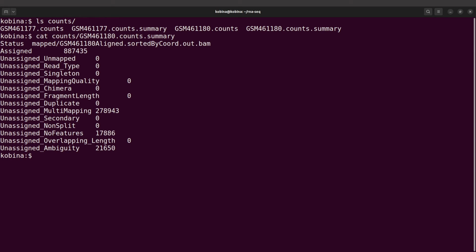Now let's take a look at something. We have two samples, by the way, so we have read count for two samples. You could also have a situation where you have more than two files or two outputs, i.e. more than two samples. In that situation, it will be useful to aggregate these reports into a single report or a single file that you can read. So what we are going to do next is to aggregate these two reports, and then view them as a single report using MultiQC.